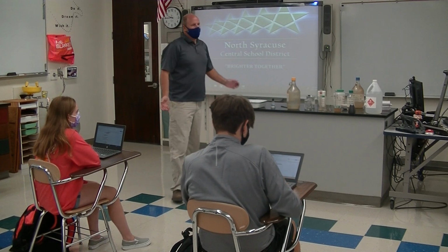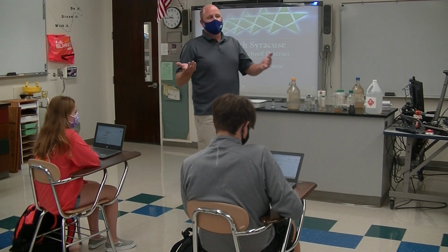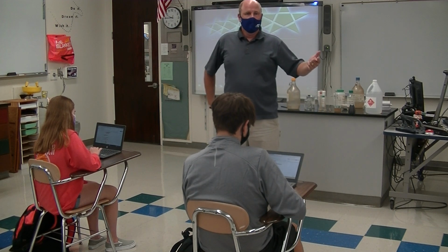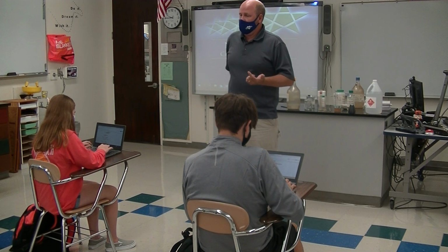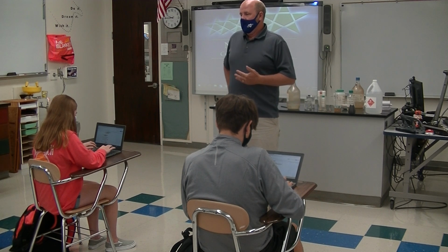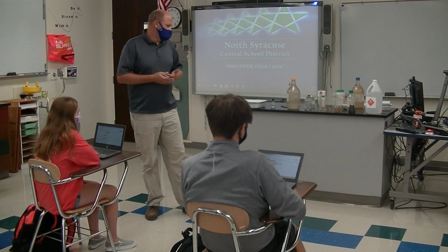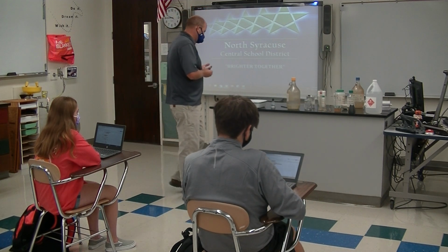All right, treatment for odors. This is at home or here or wherever. The terminology for treatment for a bad odor is to seek fresh air. Now that can be done in lots of different ways. You leave the area, you turn a fan on, you cover the material and leave the area, whatever. But the terminology is to seek fresh air.